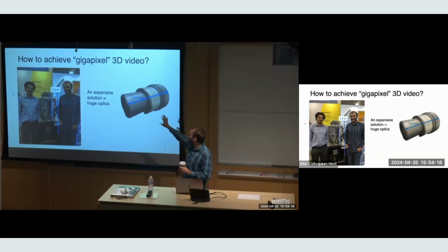I will show a couple lenses later in the talk that can support a large number of resolved pixels that we've been working with. This is actually a lens from an old X-ray system that is mapping the X-rays hitting a fluorescent screen onto a large format film. There it has a very high numerical aperture to capture lots of the fluorescent light and can resolve over a large area. But these lenses are few and far between. And you still need a sensor with lots of pixels, right? You're still left with that fundamental detection problem if you're focused on this single lens design.